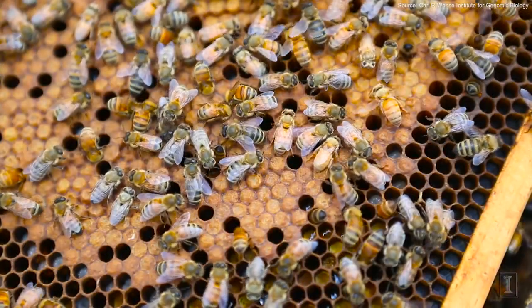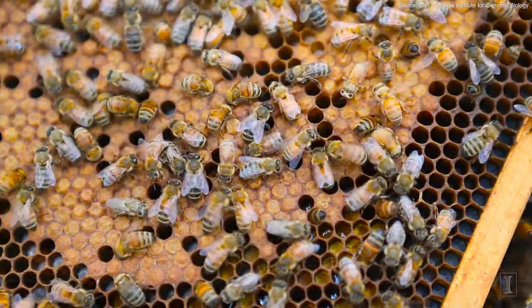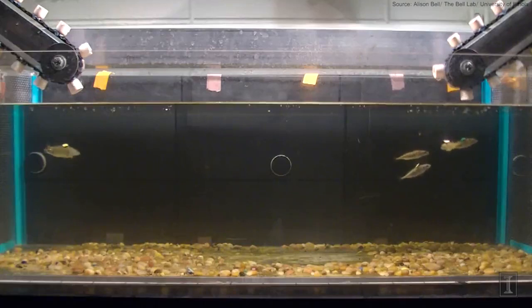The technologies in our labs, particularly in the Functional Genomics Lab and the sequencing labs, are able today to analyze many different types of organisms, animals and plants, which have not been classical model organisms for biomedical research or agricultural research. Today we run samples on honeybees, bumblebees for neuroscience, stickleback fish, also for behavioral analyses.